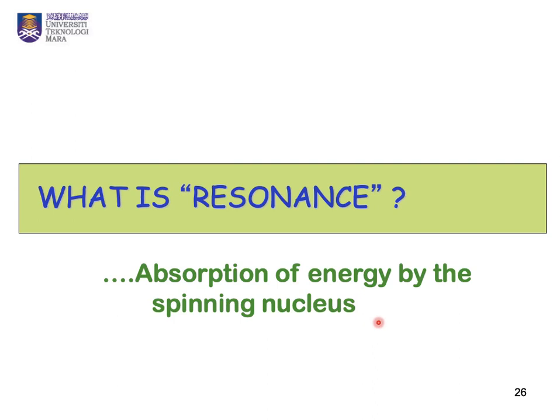Remember, some of the nuclei spin against the magnetic field, some spin toward the magnetic field. After the absorption of the radio frequency, the absorption of energy takes place, and as a result, resonance occurs. This is only possible when the system absorbs the radio frequency.